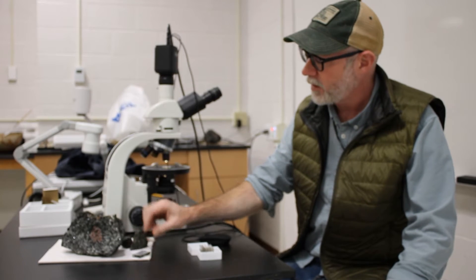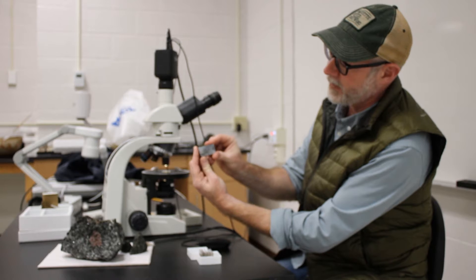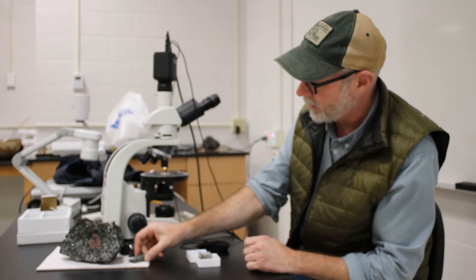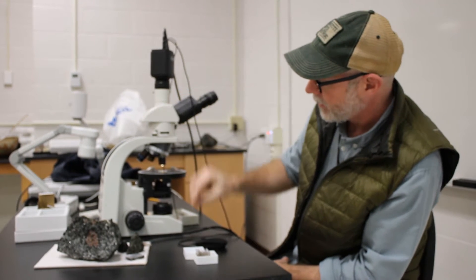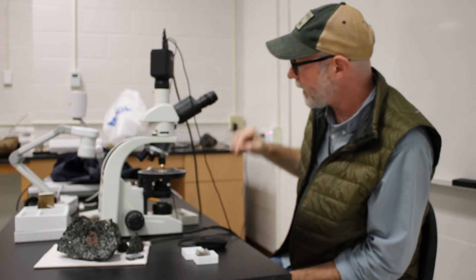We have our Gore Mountain rock again, which we cut downstairs. What we ended up cutting that into is what we call a billet — this is the piece of rock that we would either send off or make a thin section out of ourselves. The final version is actually a microscope thin section, which we can look at in a moment. This is our petrographic microscope. We have these in our labs; in this case we have a camera attached to the top projecting to the screen.